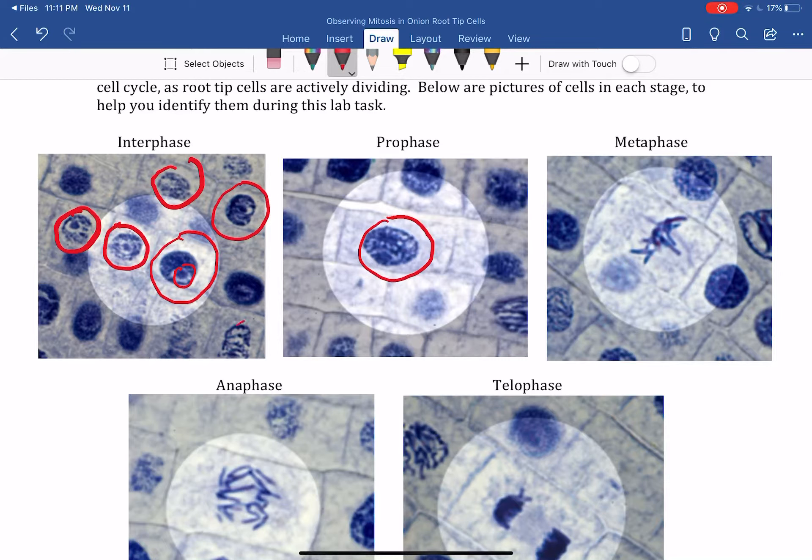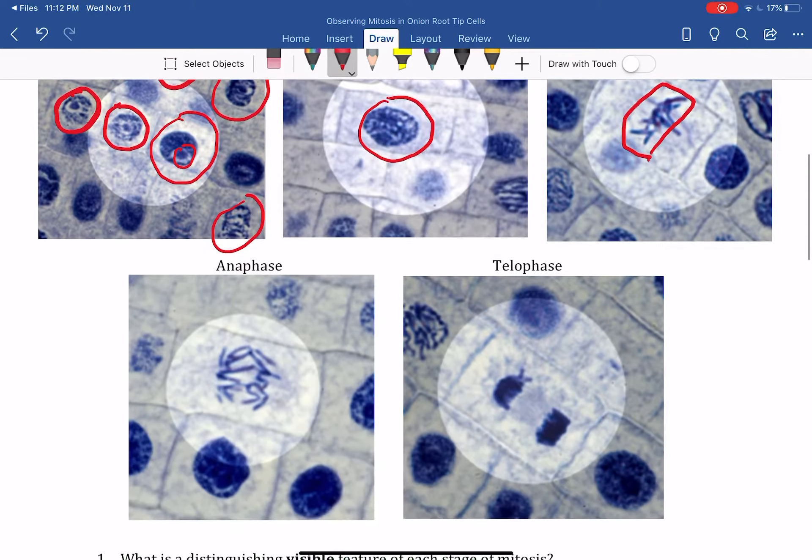And then in metaphase, metaphase is usually pretty easy to pick out. You have chromosome structures there and they're all lined up together in the middle. In anaphase, you have the chromosomes that are beginning to pull apart. Now some of them may appear more or less apart than these two, but that would be anaphase.